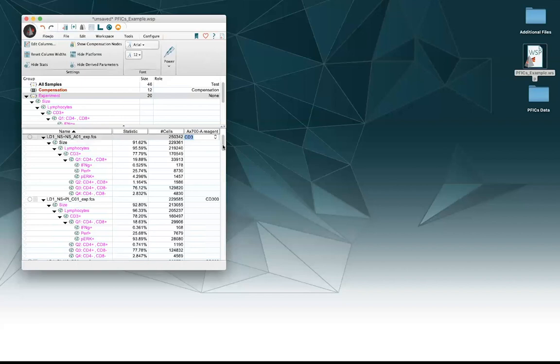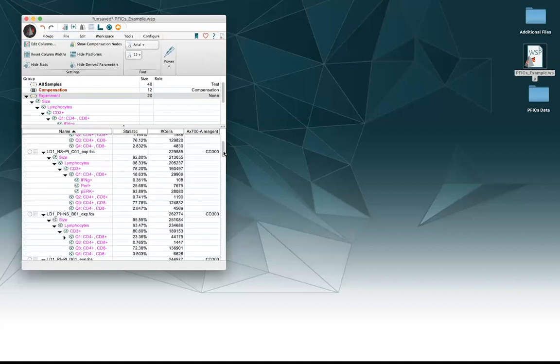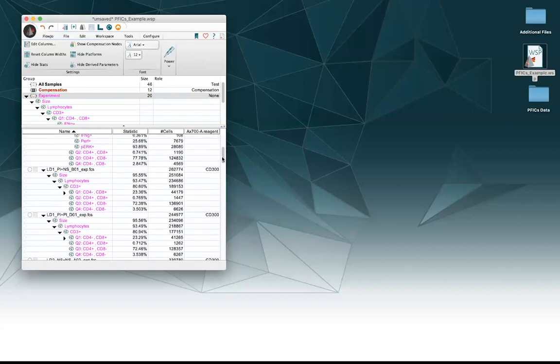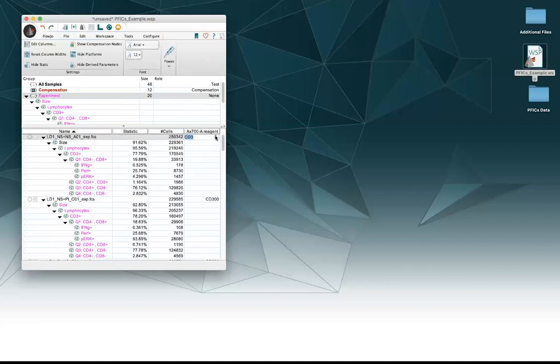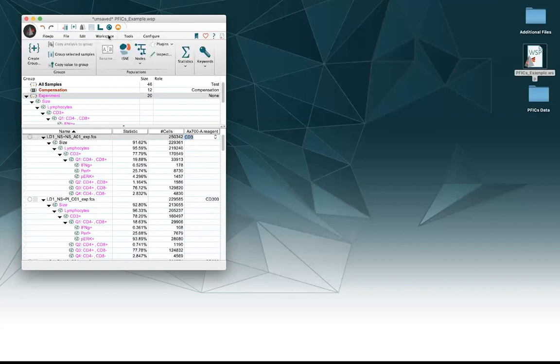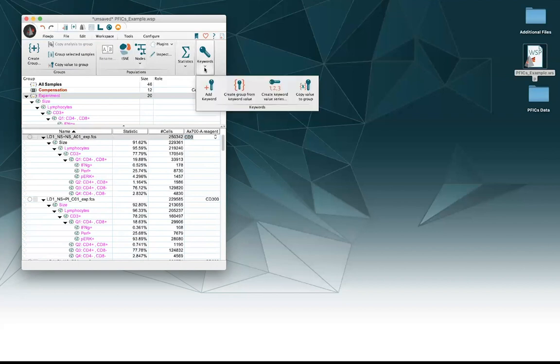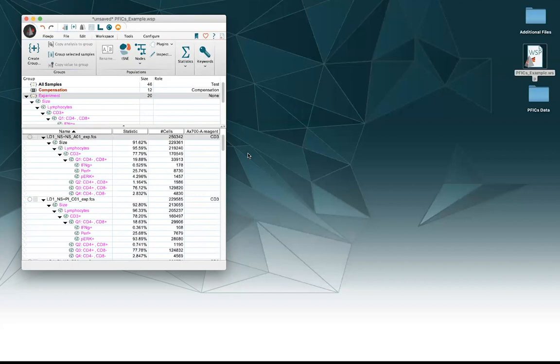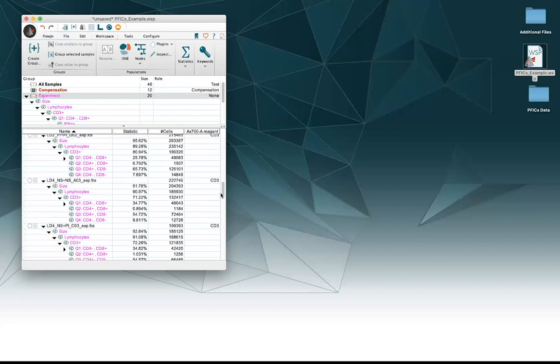Unfortunately though, it's named wrong for all my samples. So if I want to quickly apply that name change to all the samples in the group, that's very easy to do. All I have to do is go to my workspace tab, go to the keywords, hit copy value to group, and now they're all CD3. Perfect.